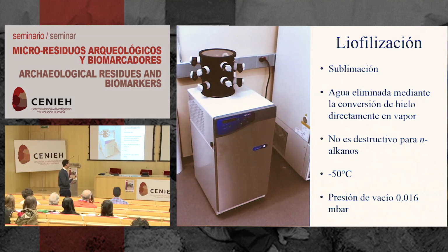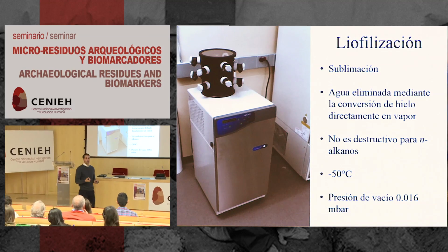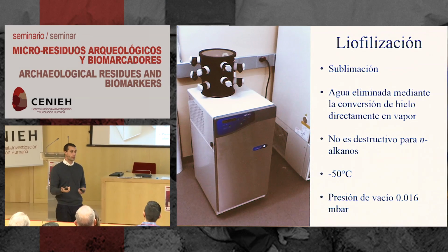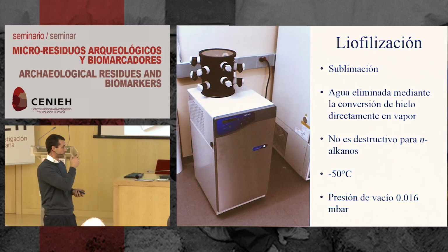Freeze drying is a pretty simple technique. It uses sublimation. It'll take your sample, freeze it, and then change the pressure so it turns that frozen material directly into water vapor, and it'll collect it in this contraption here.